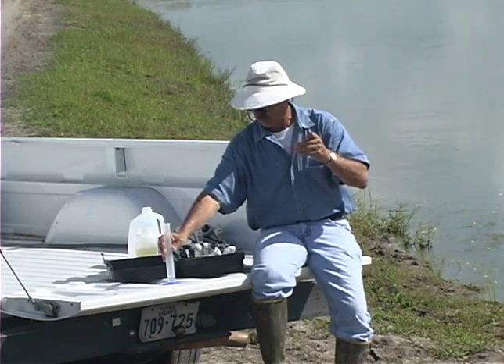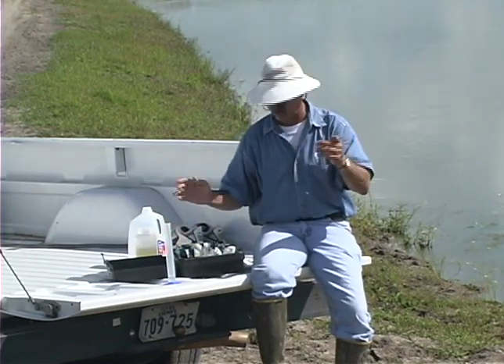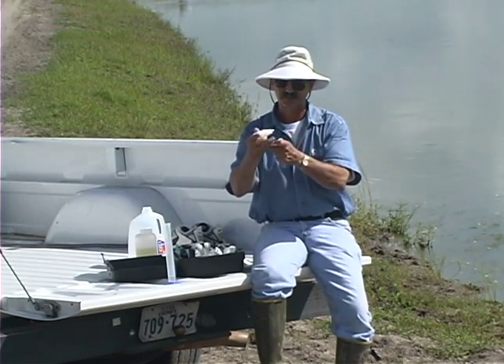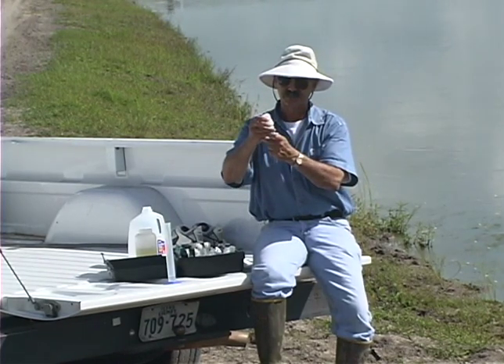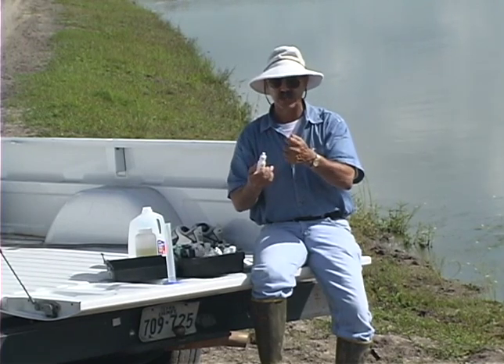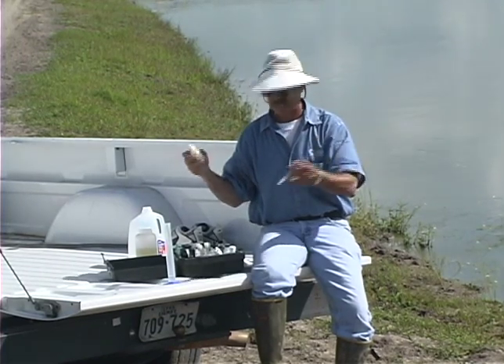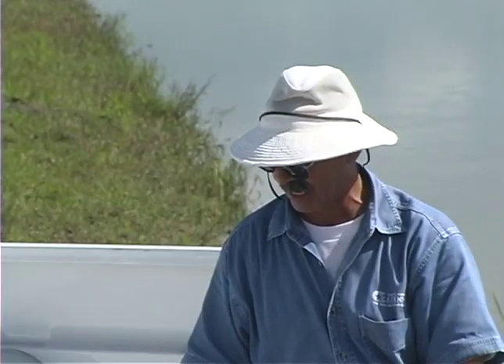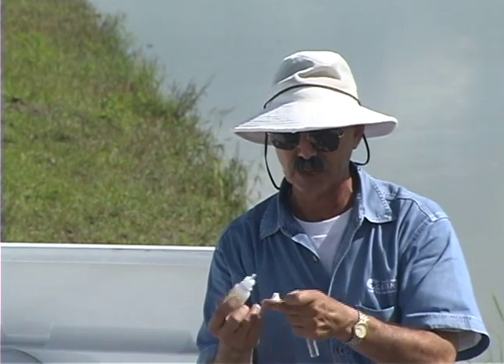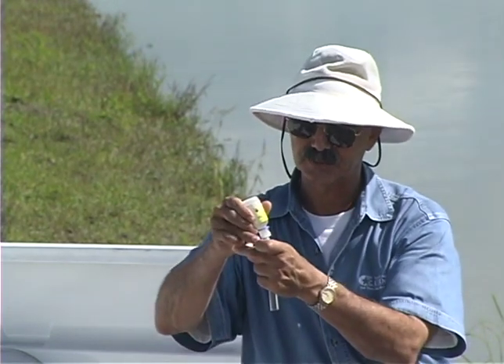We'll do the test again, just the same way we did it before, starting with the 4 drops. We'll cap that and wait a minute, and then we'll add our second reagent. The minute's up, so now it's time to add our second reagent. We add 12 drops of this reagent.